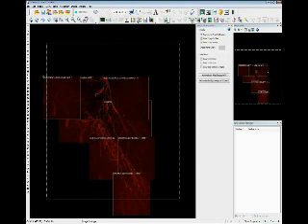You don't have to use LSM files. This will work with any input stack. It could be Olympus, it could be 2-photon, it could be just wide field fluorescence if you'd like, or bright field. There's no necessity. It could be 2D also. And in that case, you would just select the automatically align images in X, Y.